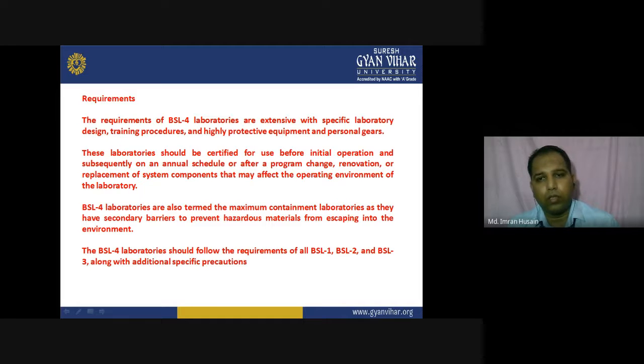After a program change, renovation, or replacement of system components that may affect the operating environment of the laboratory. These laboratories are also annually analyzed and audited for any change in technology, renovation, or repairing. BSL-4 laboratories are also termed maximum containment laboratories as they have secondary barriers to prevent hazardous material from escaping into the environment.